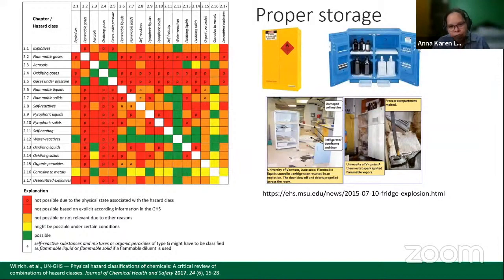So explosion proof refrigerators are basically refrigerators wherein you have no source of sparks or electronic sparks. If you are refrigerating organic solvents, there will still be some escape of vapors that can be flammable, and so you have to make sure that your refrigerators do not have sources of heat or sparks. That is the need for these explosion-proof refrigerators. And if you make use of the usual household refrigerators and anything happens, there will be fairly large damage to the lab if it explodes.